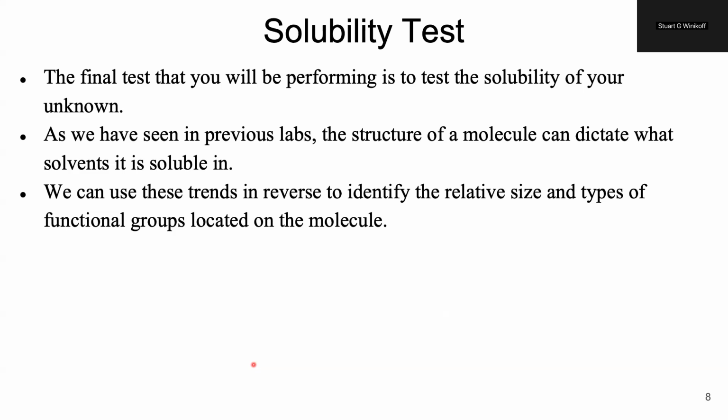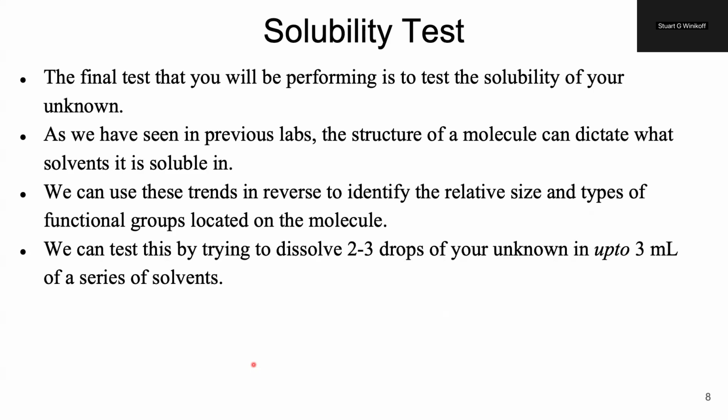Similarly enough, if it dissolves in acid, this means it can likely be protonated and contain something like an amine. If it dissolves in a base, it means it likely contains an acid functional group, which then again will make it ionizable. Very similar to the trends we've used to help separate molecules by acidifying or increasing the pH of a sample to help separate between an organic and aqueous phase.